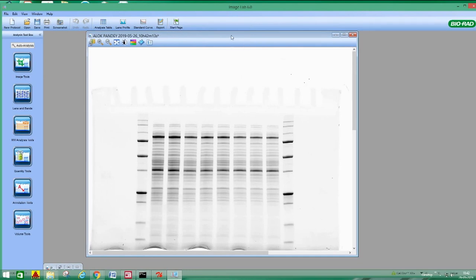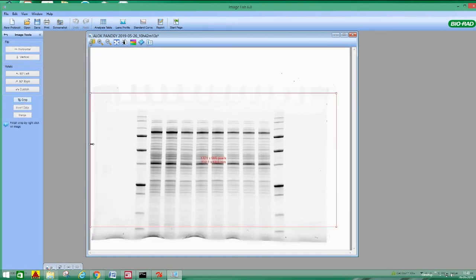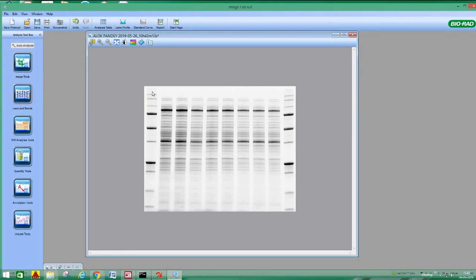First, after getting the image, you can open any imagelab.scn file from the instrument. So go here on the left side top panel, you can see image tools. If you go there, there are different options. You don't want to see the complete picture, so you can crop the image like this, just say crop. So this is the cropped image, and go back here.